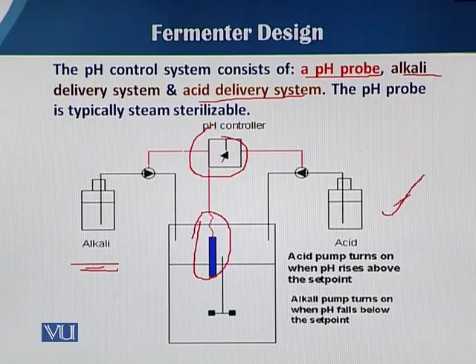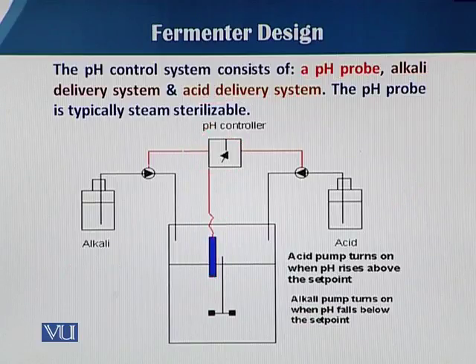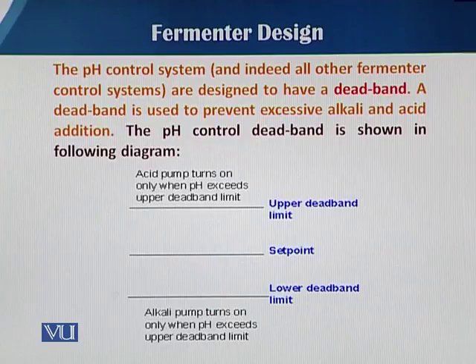First it senses the pH. According to the change in pH, if the pH decreases from 7 toward 6, 5 and so on, then the signal goes to the alkali. But if the pH increases from 7 to 8, then the signal goes to the acid delivery system. So how can this total delivery system be managed?